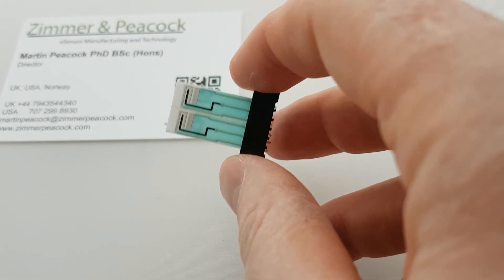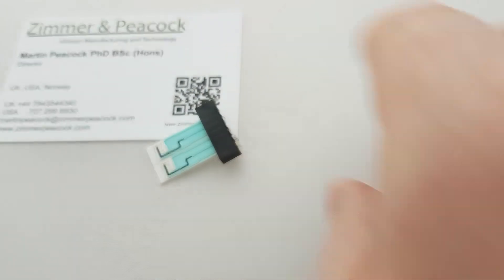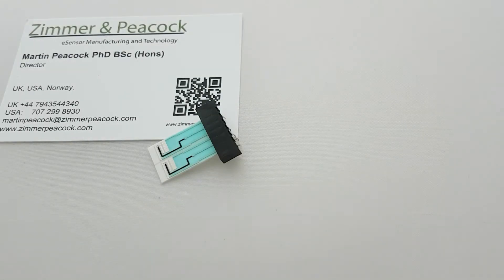We don't have to explicitly have a two-electrode system in our catalogue in order to provide a two-electrode system, because we make them in wafers, we laser scribe, and then we singulate. But if we singulate so we don't actually split two electrodes from one another, it immediately forms a pair. I hope that is useful. If you have any questions, please don't hesitate to contact Zimmer & Peacock.